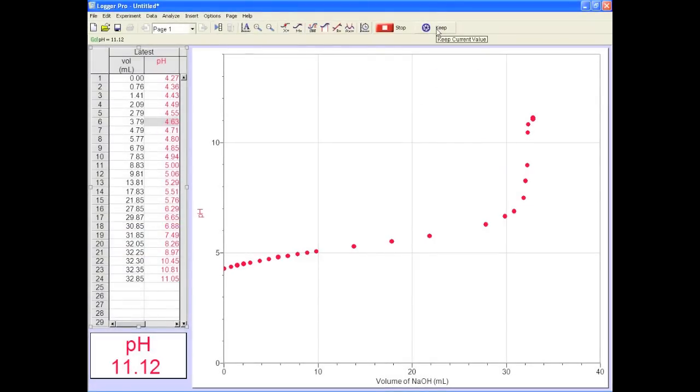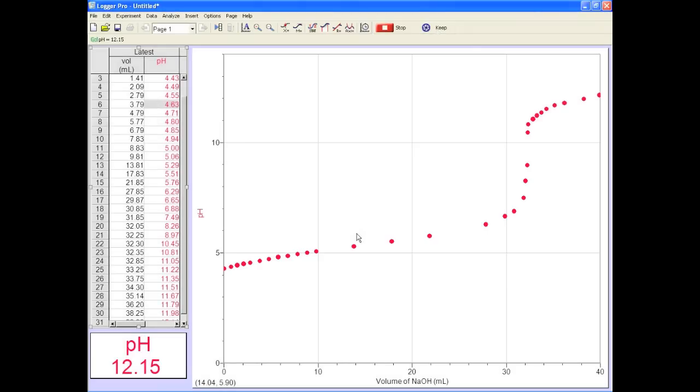Once the pH change slows down again, you can add larger volumes of titrant until it levels off. Get a few more points and press stop. If it looks like what you see here, thumbs up.